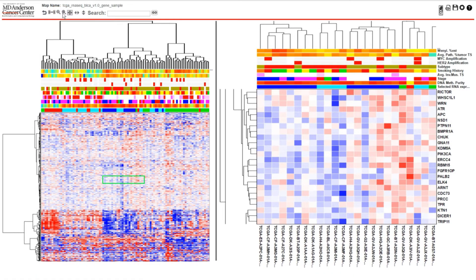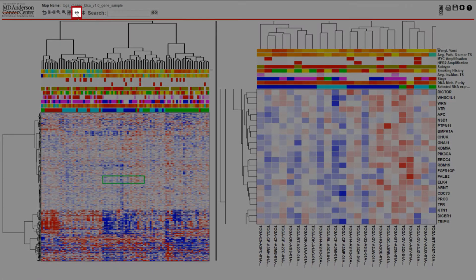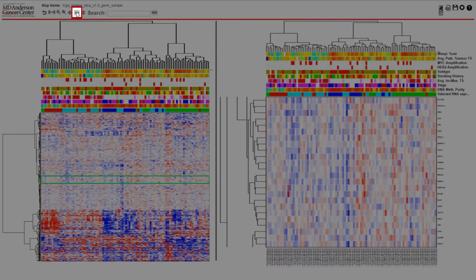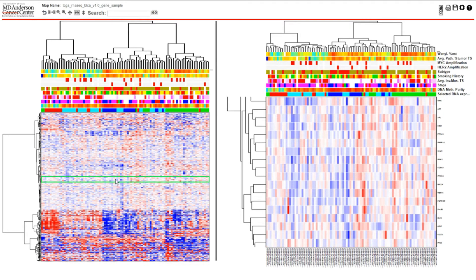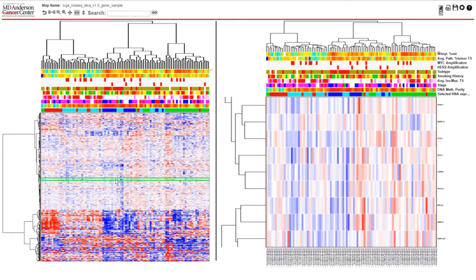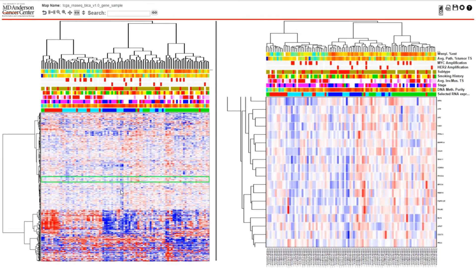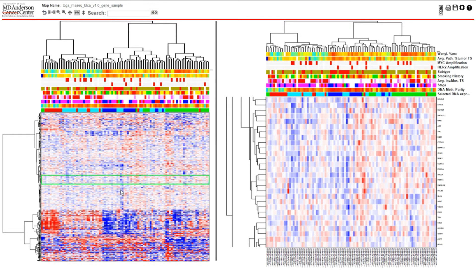It is often useful to see the entire width of the heat map and row labels. To do this, use the horizontal ribbon view icon in the top panel. You can use the same controls mentioned earlier to zoom and select portions of the heat map, but you will always see the full row.